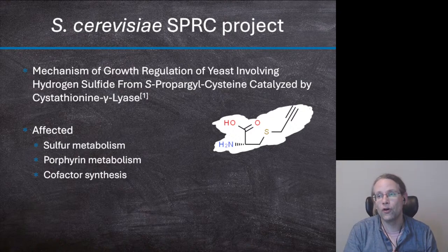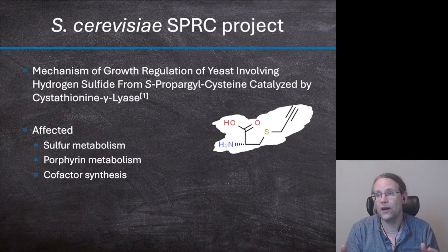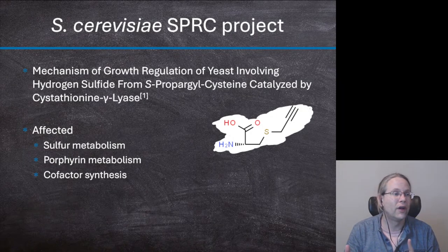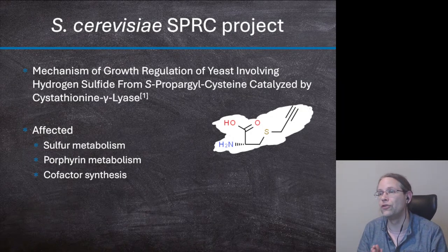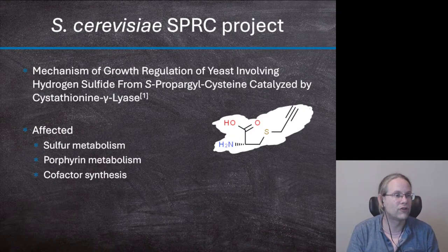And of course, look at other data sets, right? You have this pipeline, you can download other RNA-Seq data sets from the Short Read Archive, which have more samples, higher read counts. Just make sure that when you do this, you change inside of your pipeline the name of the reference, and make sure that the reference genome, the GTF file, and all of the other files come from the same release.